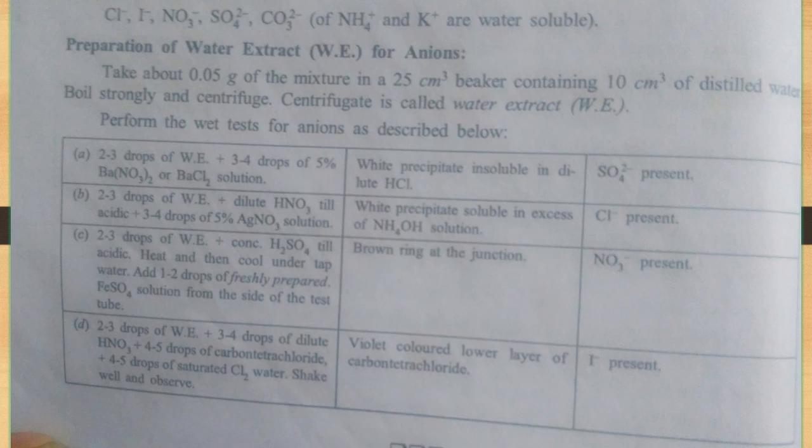Suppose you are given a salt of magnesium sulfate and potassium nitrate. That means magnesium sulfate is the major salt. You will detect magnesium by quantitative analysis, volumetric titration. But sulfate ions, you will get the test of sulfate ions with water extract.